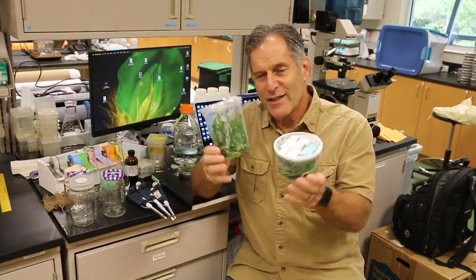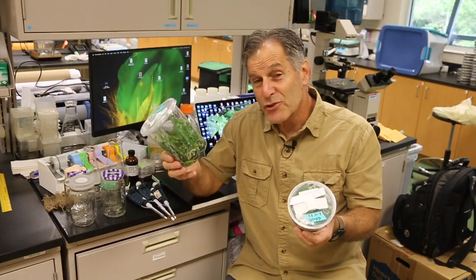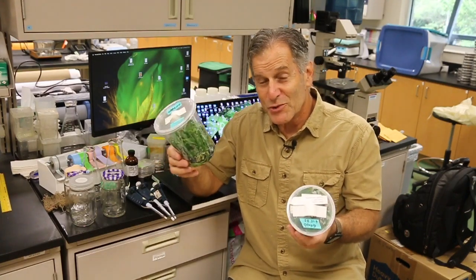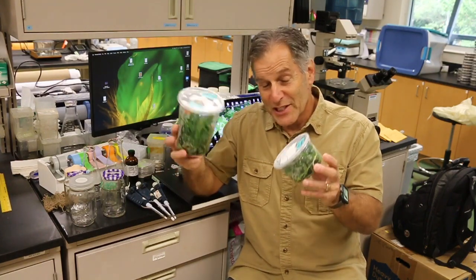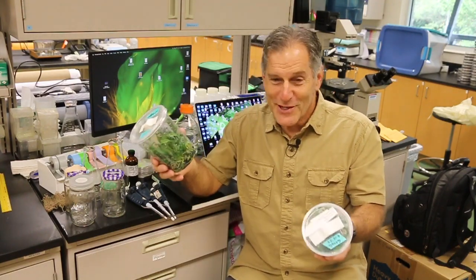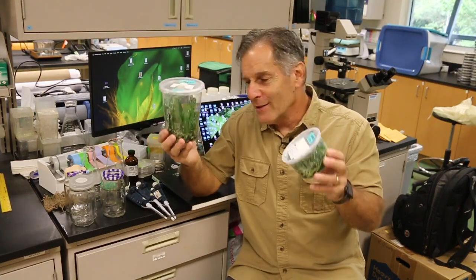I should also say, they're round, as you can tell. There are some square containers that people were using in this area because they fit a little bit better on shelves. Those have not really received a lot of good attention, and I think maybe it's because the square ones are hard to clean because of the corners. I'm not sure. They were reusable, and they were fine, and they worked well. But I like using these containers.